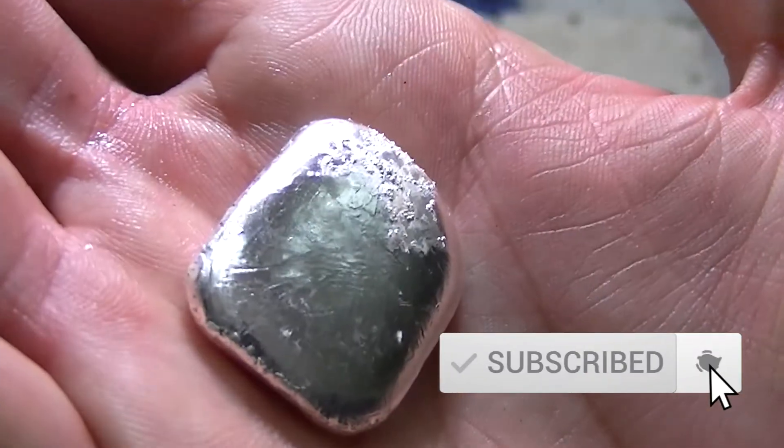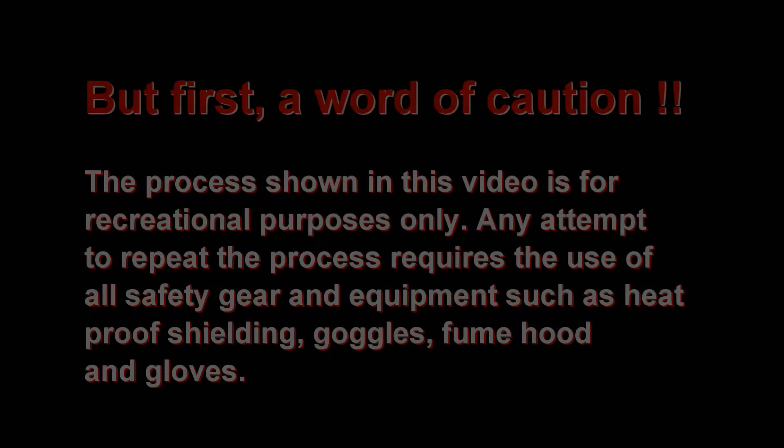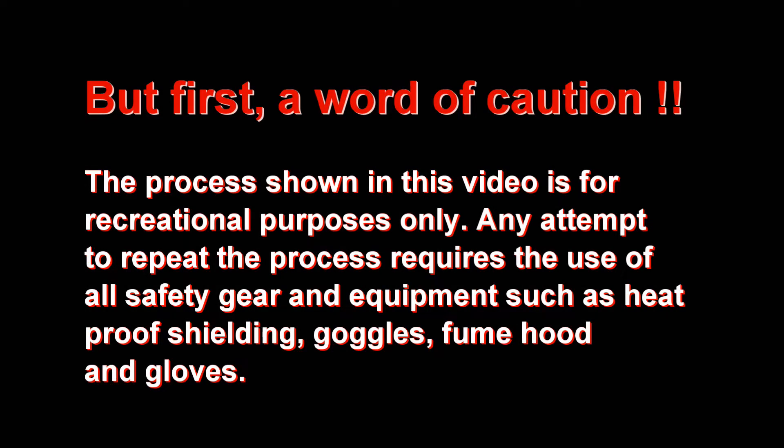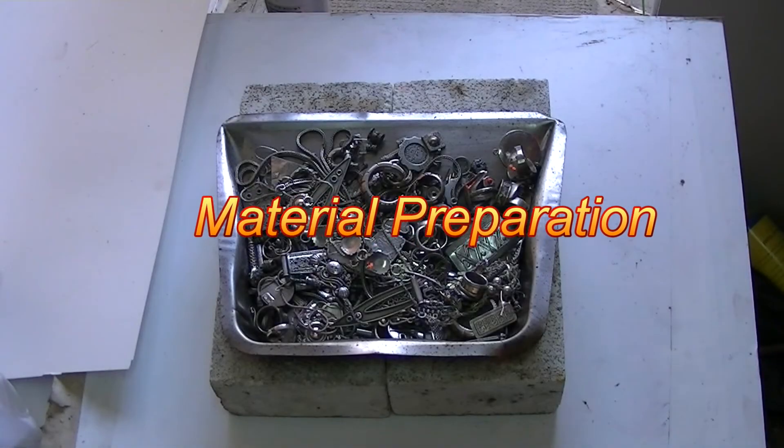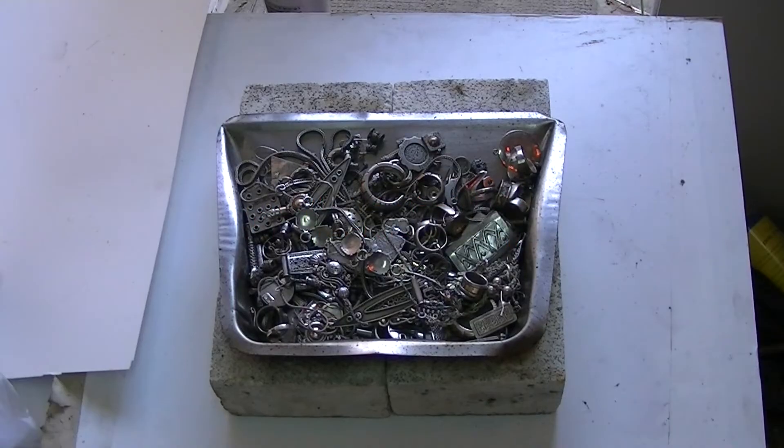But first, a word of caution. The process shown in this video is for recreational purposes only. Any attempt to repeat the process requires the use of all safety gear and equipment such as heatproof shielding, goggles, a fume hood, and gloves. Here I have about 500 grams of old sterling silver jewelry.